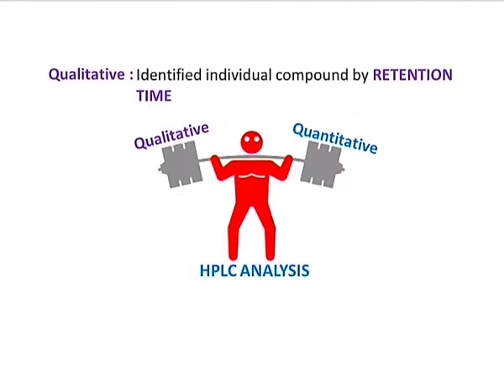Under that particular set of conditions, your solute should always get eluted out with the same retention time. It means here we have generated a new morphological signature feature for a particular component, which is its retention time. So, this is what we mean by qualitative analysis.